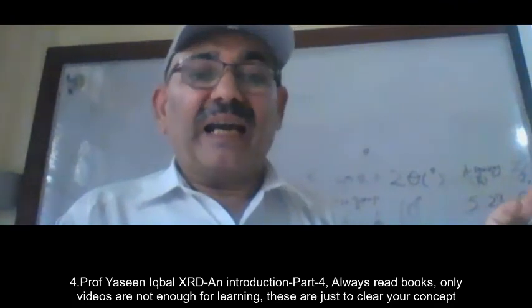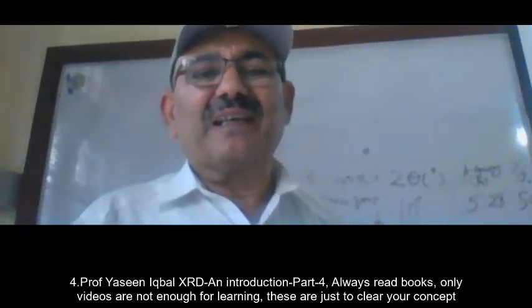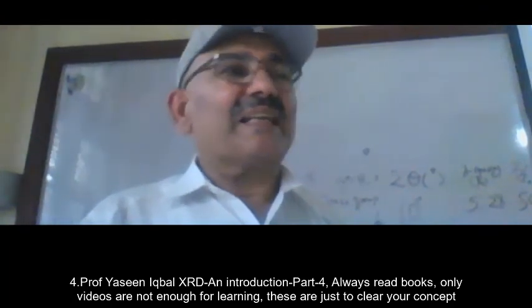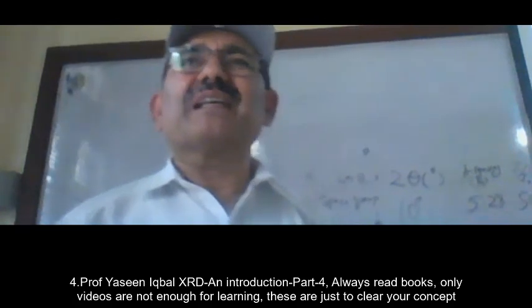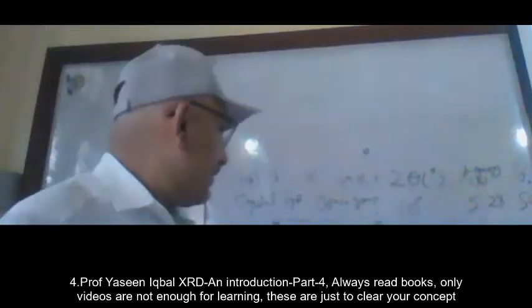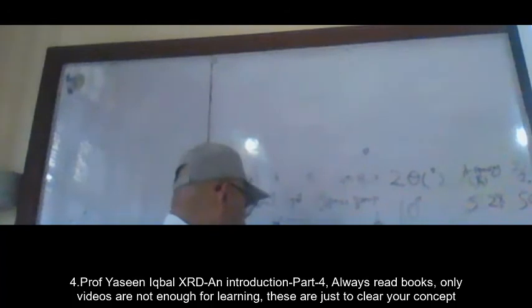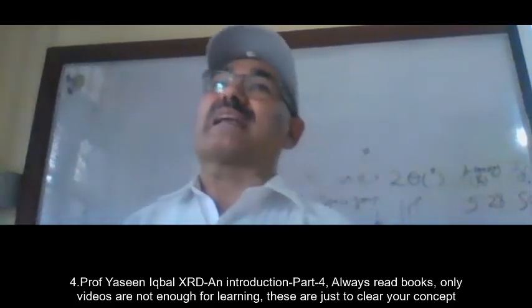Similarly, they use wide angle scattering, which is at angles close to 90 degrees. Obviously, this deals with smaller crystal dimensions. When you go near 90, if it is 5.2, 4.6, 3.3, then at 90 it is about 1 angstrom or less.